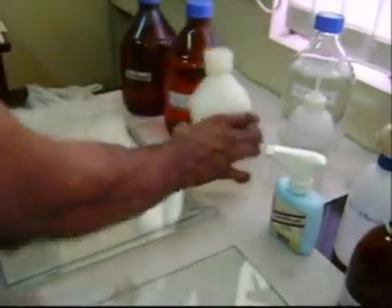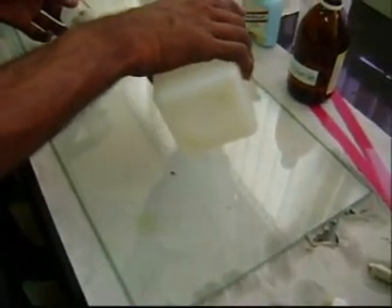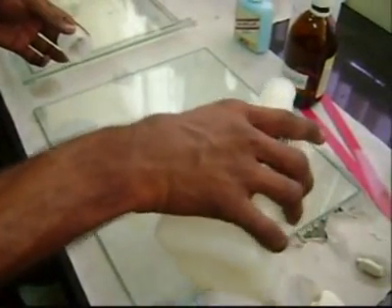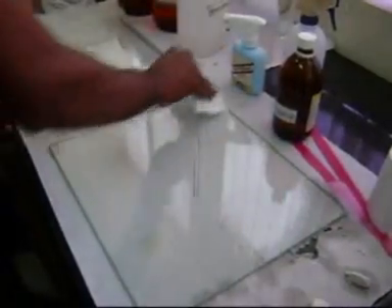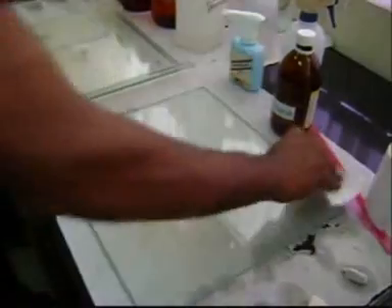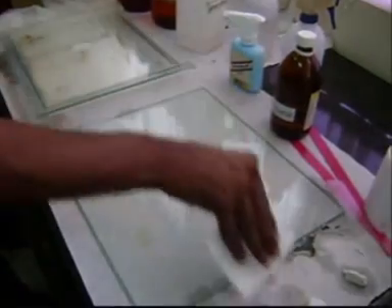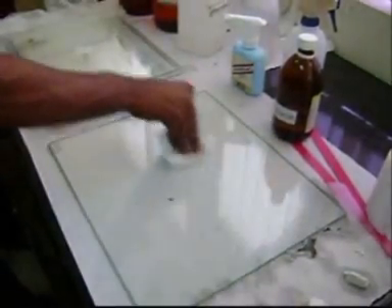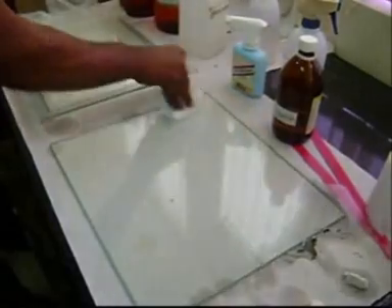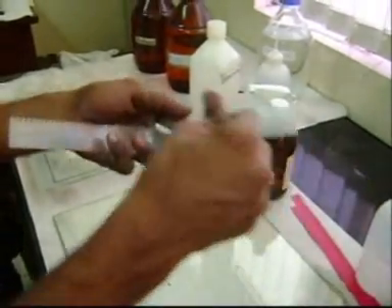Then apply 70% ethanol on the notch plate. Then apply 70% ethanol on the surface of the glass plate so that a layer forms upon the glass plate, which helps in the attachment of the gel to the glass plate. Then wipe the spacers and comb with the help of 70% ethanol.